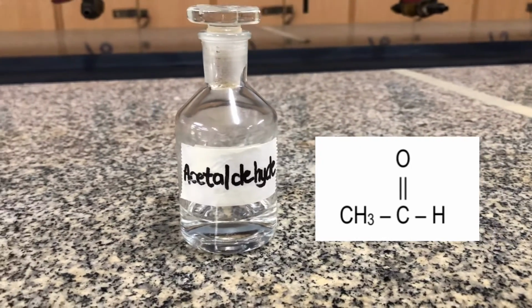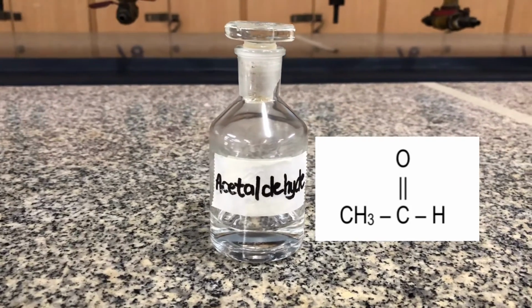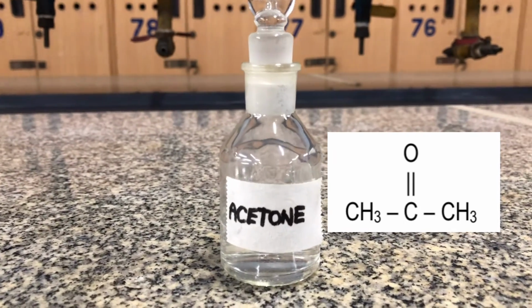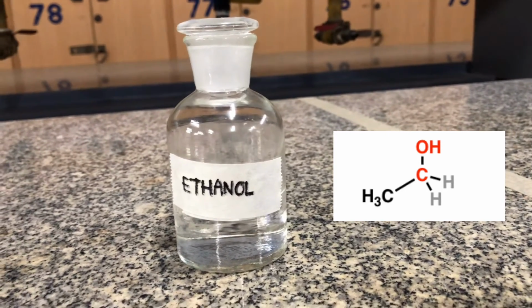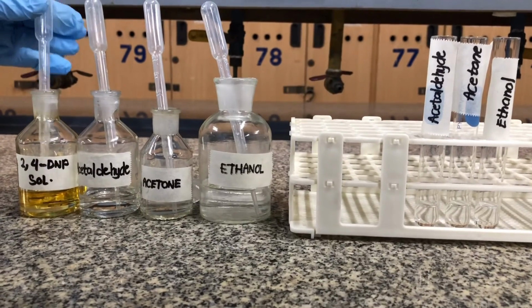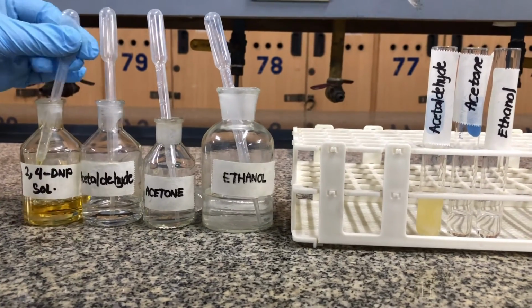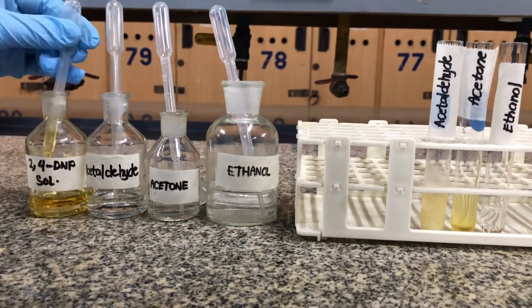The representative aldehyde used for this experiment is acetaldehyde. The representative ketone is acetone. I also used ethanol in the experiment for comparison of results. The 2,4-DNP test is conducted by adding 1 ml of the 2,4-DNP solution into a test tube already containing 1 ml each of acetaldehyde, acetone, and ethanol.